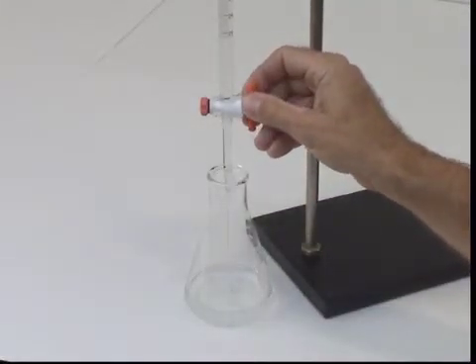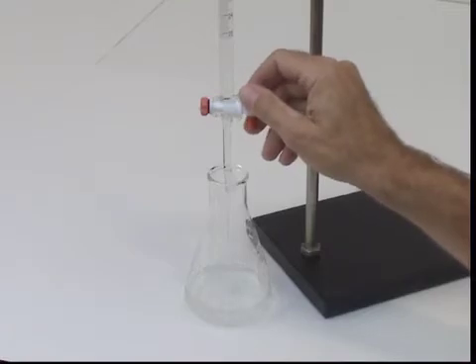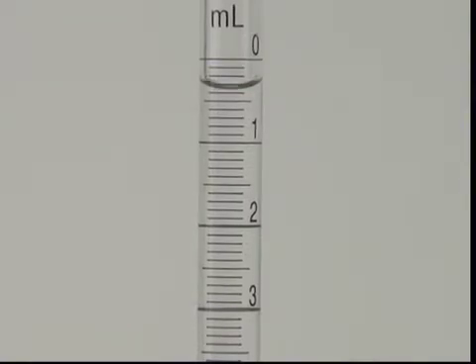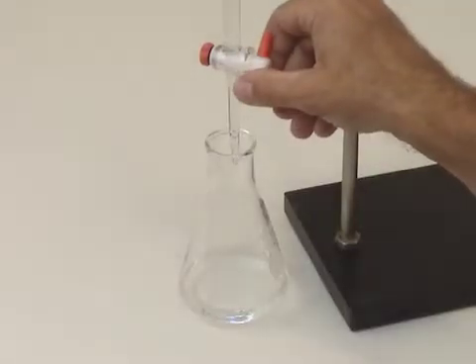A good titration should have a volume of around 15 to 20 milliliters. So we can add most of that volume in one large portion. Open the stopcock fully and allow 10 to 12 milliliters to drain in.